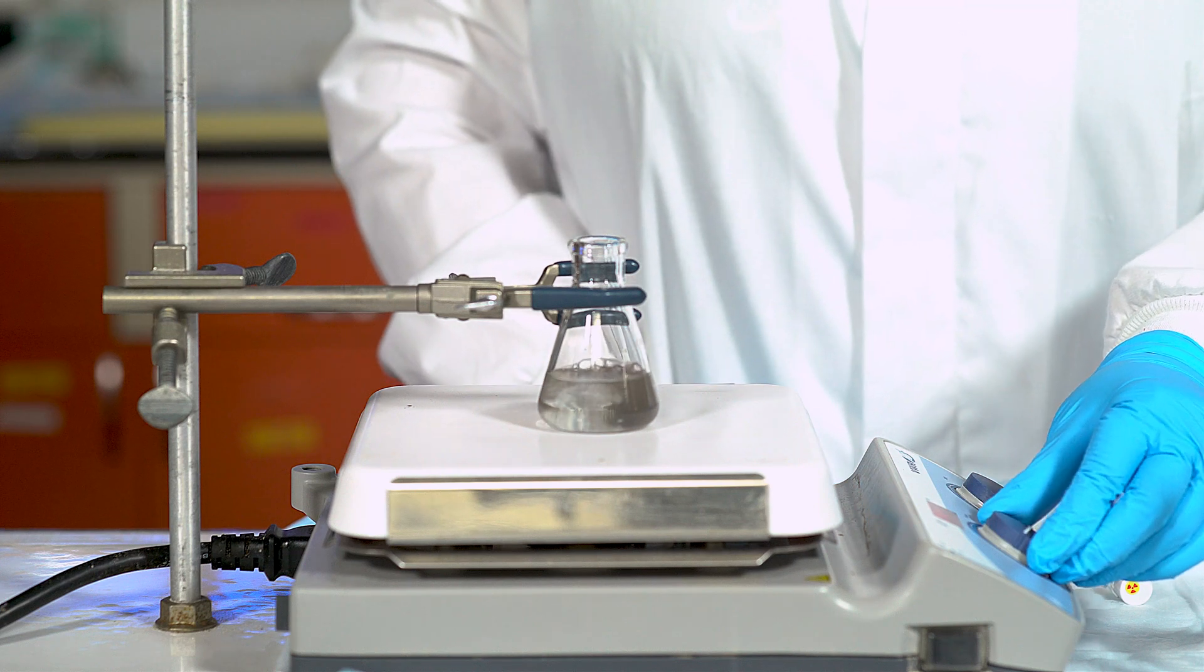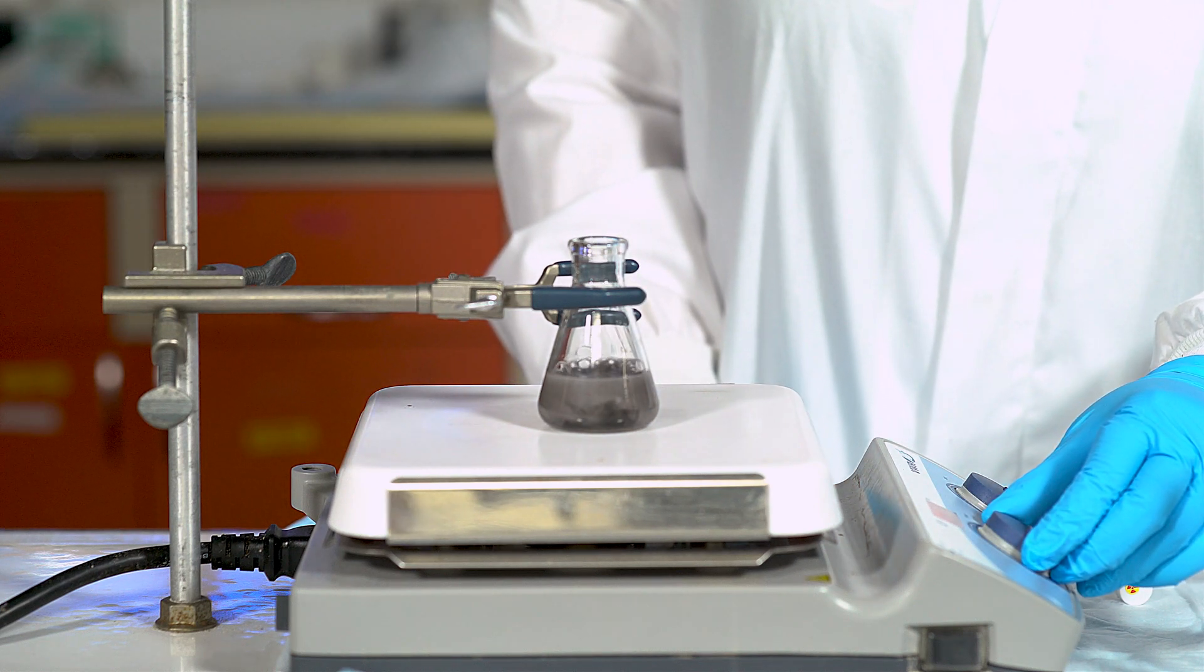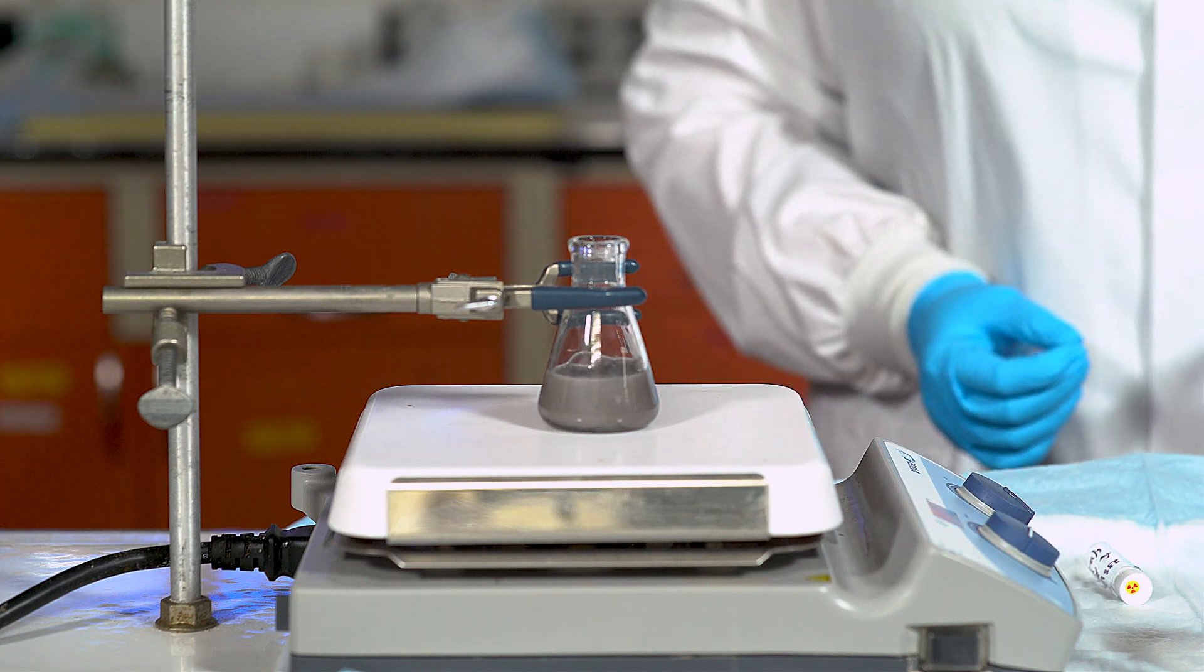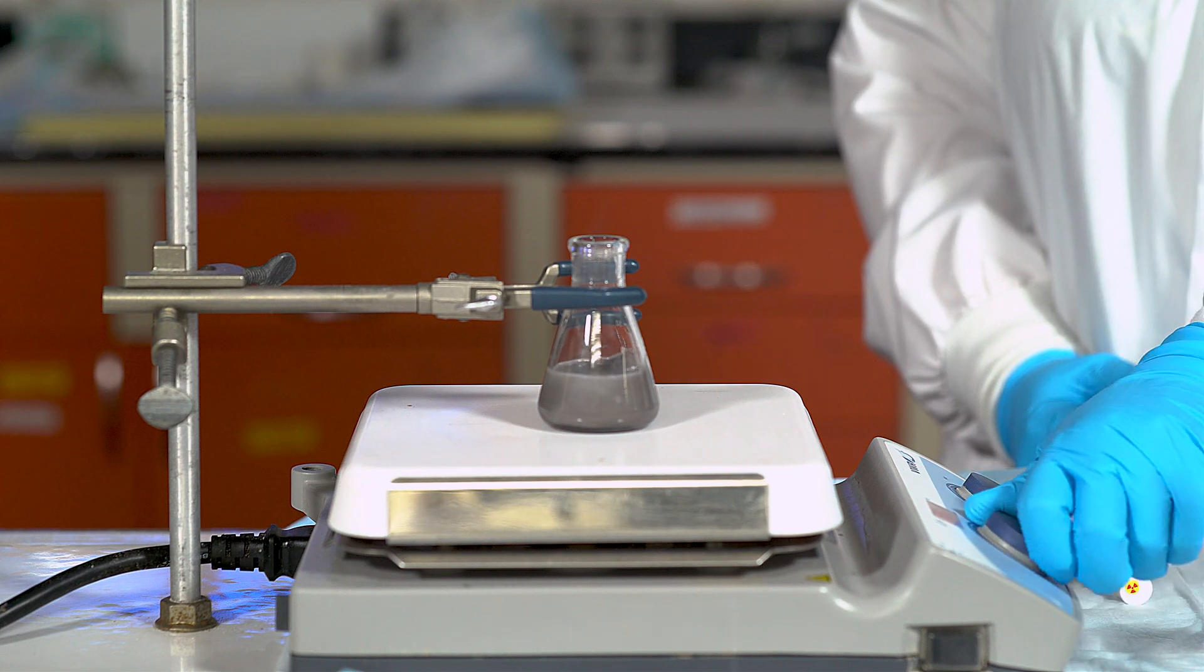Here we can see that the solution turns a dark gray-green color. However, the dissolution was incomplete. This is evidence that the sample contains uranium dioxide, as it dissolves less readily than pure uranium metal in hydrochloric acid.